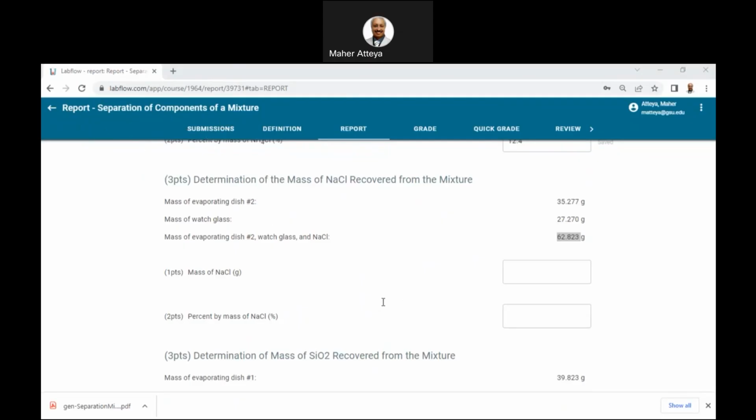62.823 minus 35.277 minus 27.270 equal to, let's copy this one here and paste it.